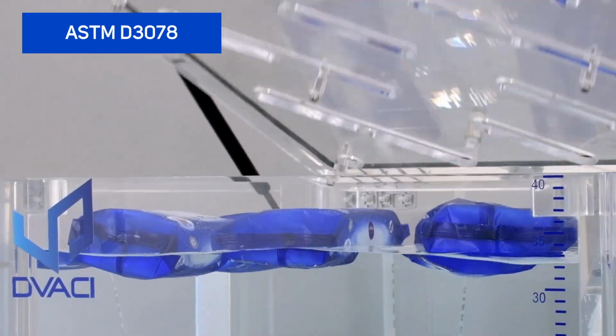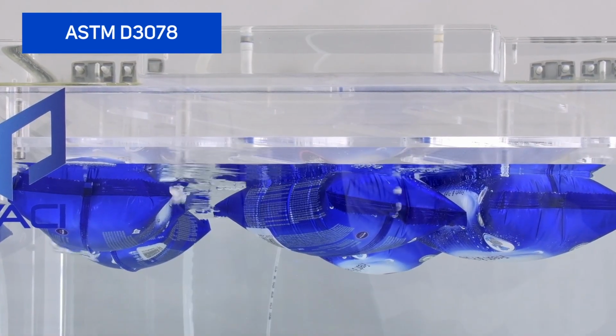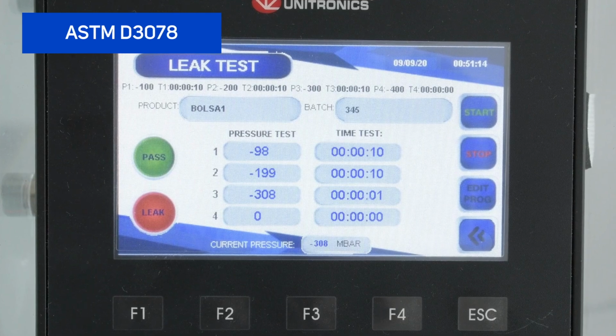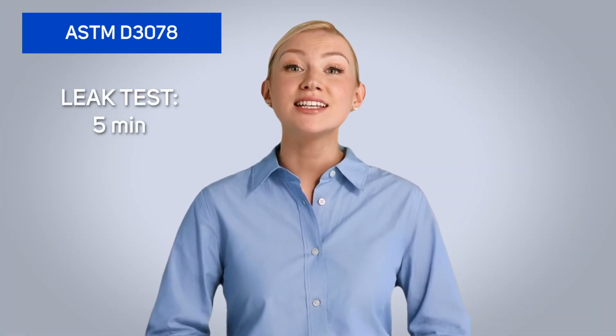For an immersion leak test, such as one following the ASTM D3078 standard, it's quite quick. Leaks become visible almost immediately once the desired vacuum level is reached. Including sample handling, the whole process usually takes under 5 minutes. I see. And what about dry tests for products containing liquids?